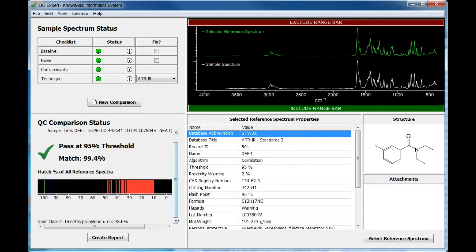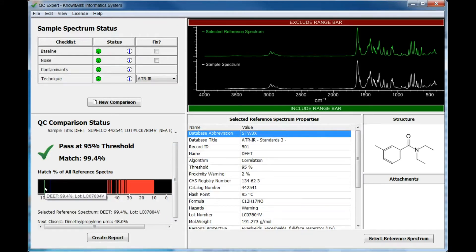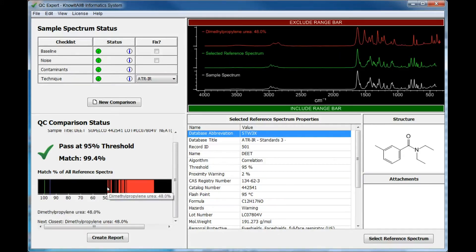QC Expert also self-validates the result by presenting a match percent of all reference spectra bar chart. This feature is important because it is not enough to know the sample matches the reference spectrum — the sample must also not be a close match to other spectra in the reference database. The bar chart displays a green line for the matching reference spectrum, a blue line for the threshold value, and red lines for all other reference spectra. Since the green line is far away from the red lines and the next closest match is a low match percentage, we can be confident that the sample matches the selected reference spectrum and nothing else.